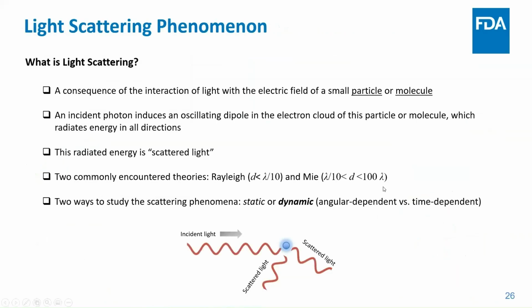That concludes the portion on the particle size concept. For the last few minutes, I will just quickly go through the scattering phenomenon, and you will hear more in the dynamic light scattering portion and also the laser diffraction portion.